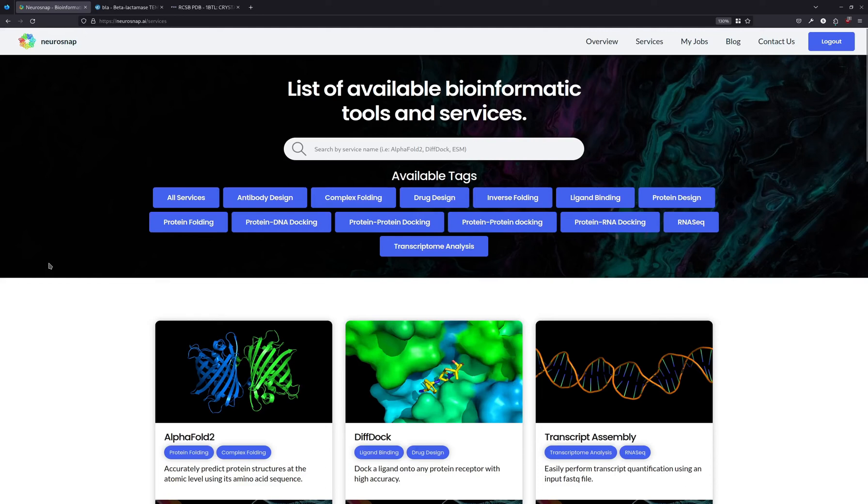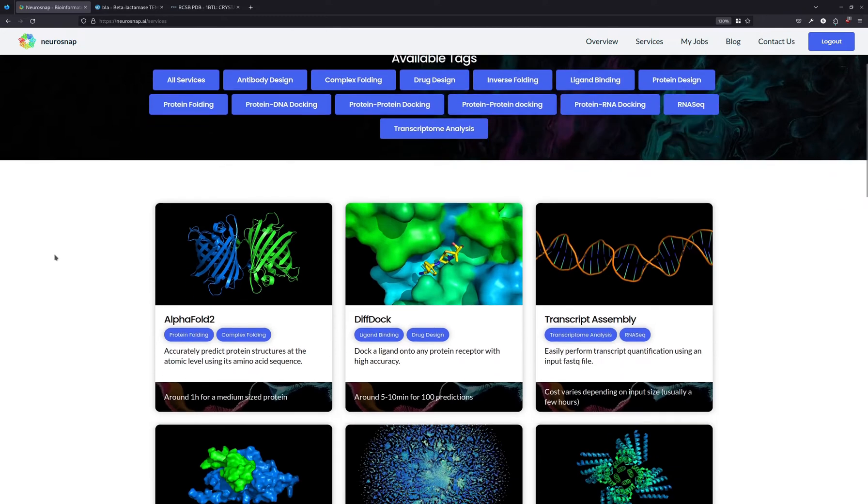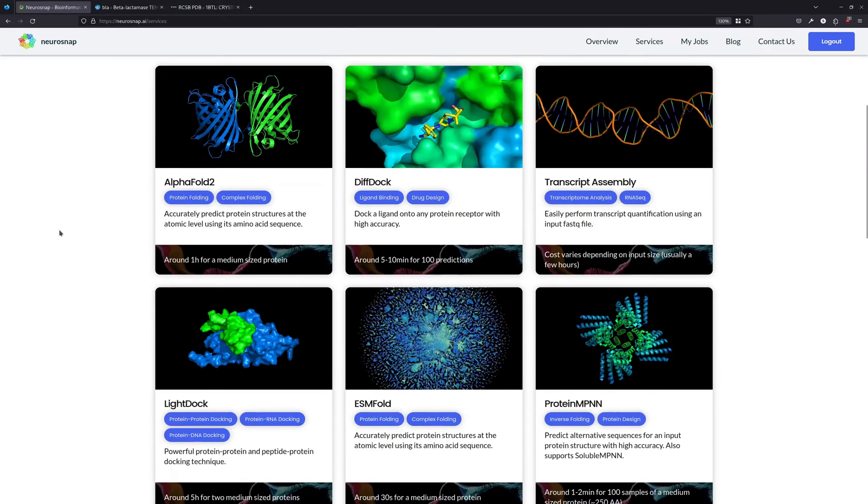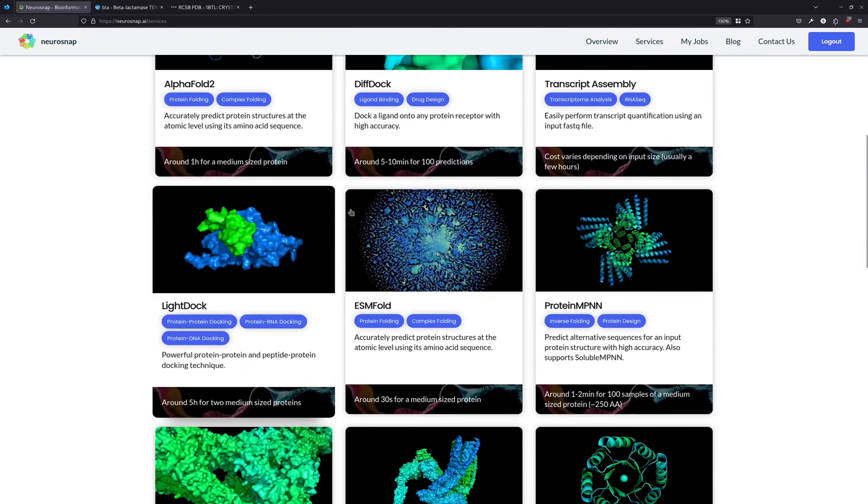Hi everyone, today we're going to be using the ESM Fold model on the NeuroSnap platform to predict the structure of a beta-lactamase protein.